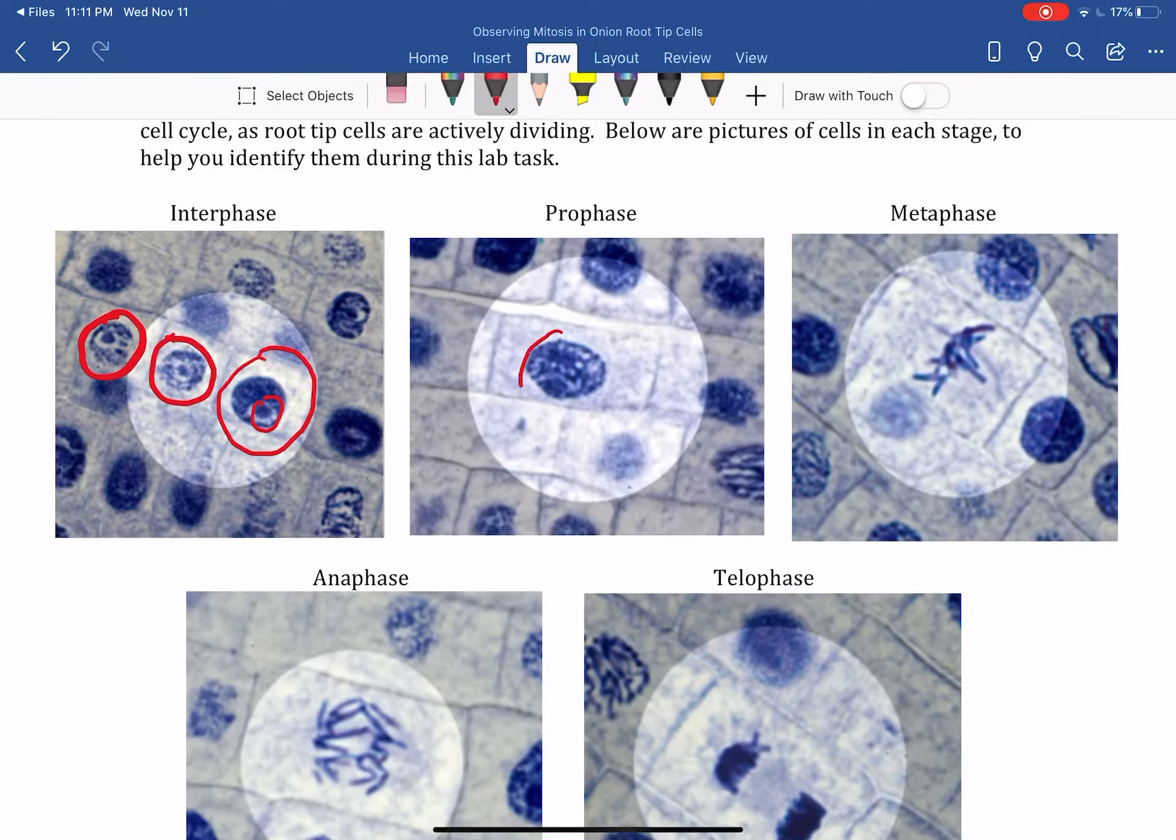Prophase is the next stage, and so you don't see that nucleus because the nucleus has started to break down, but you have chromatin. You can't see really defined chromosomes yet. So that is prophase. Looking at some more, that's probably a prophase, that's probably a prophase, this is probably a prophase.